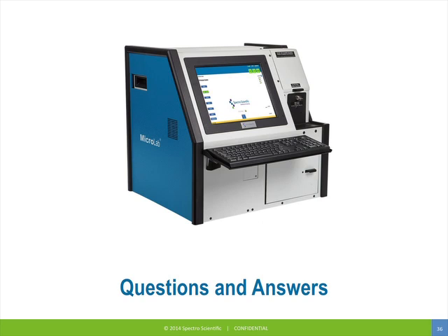Actually, this is an interesting question. It comes from one of our existing Spectro Scientific Spectrum customers. They say, we already use your equipment, your SpectrOil M. We have more than 50,000 machines that we manage in another test laboratory, and we want to move this system to MicroLab. But our customers are concerned about performance comparison. So I don't know if we have any comments on that.